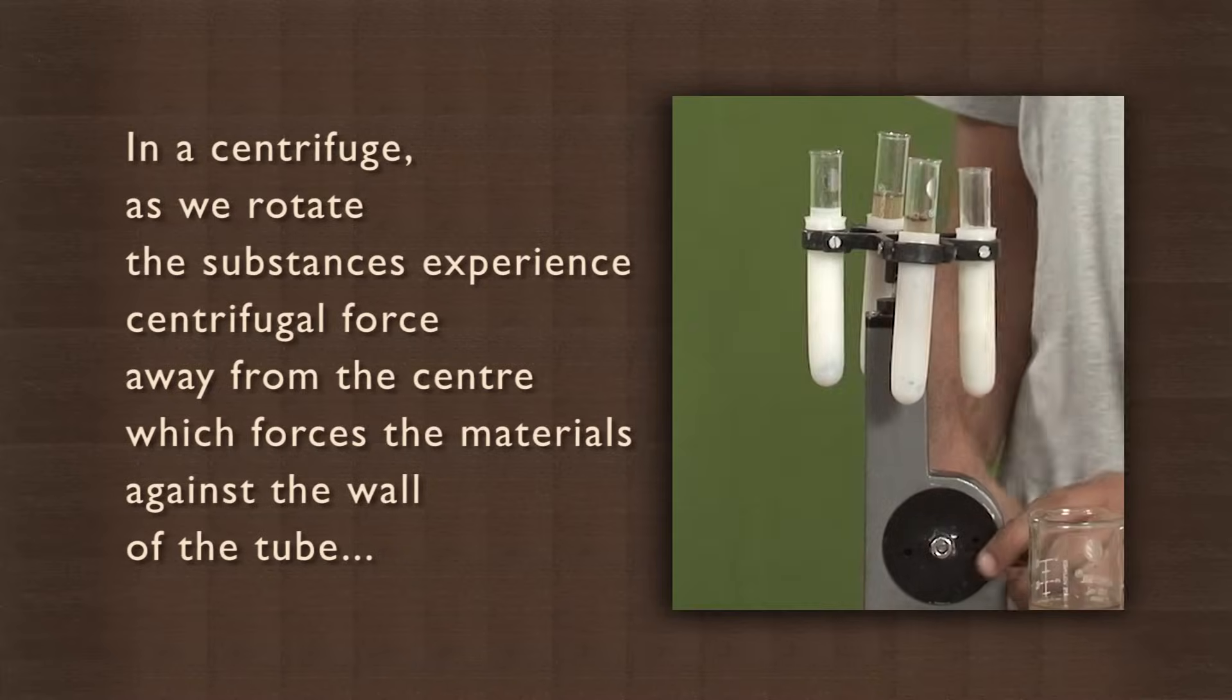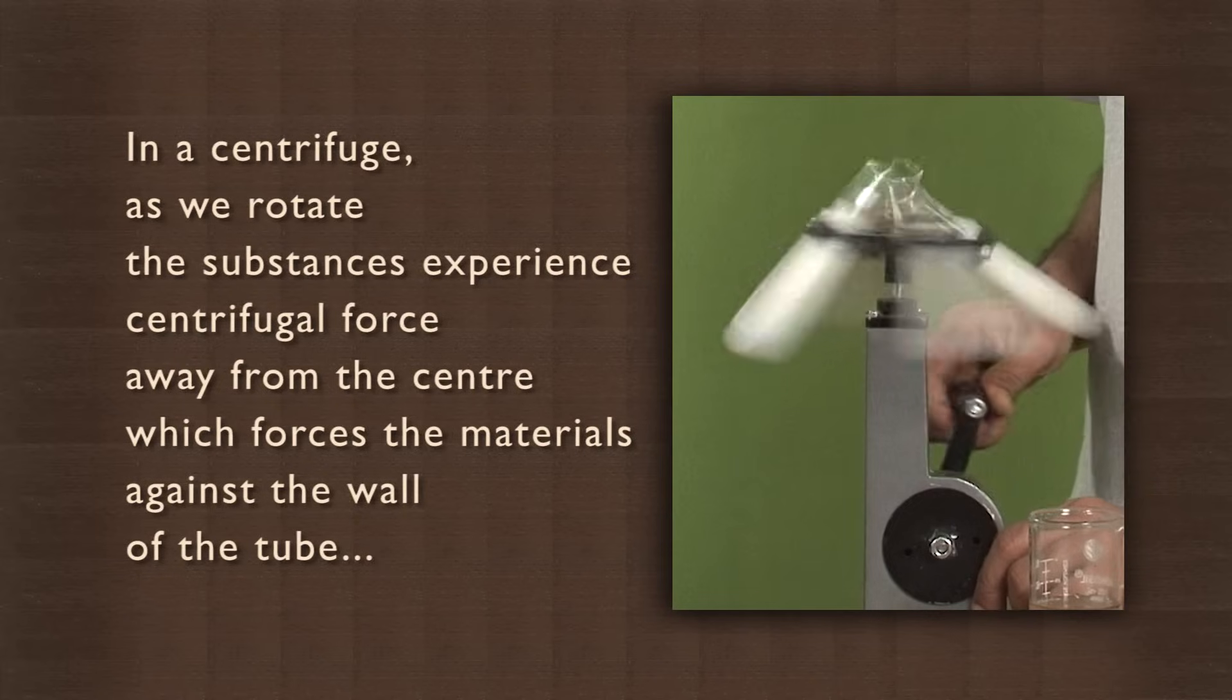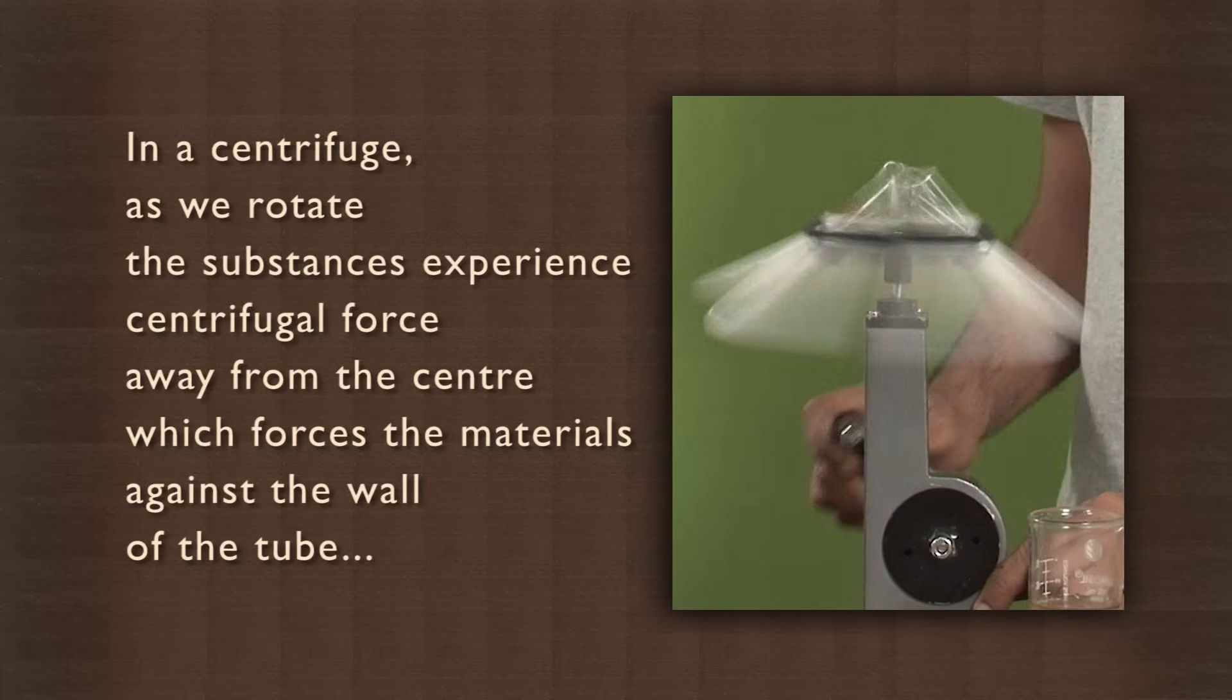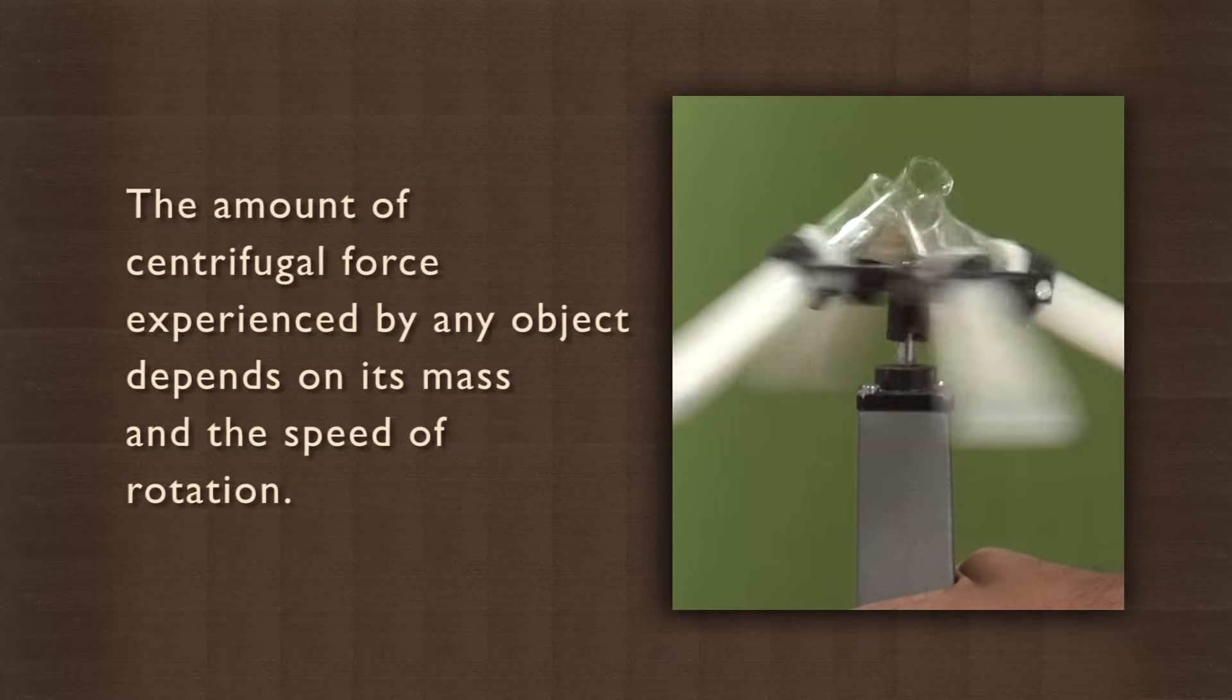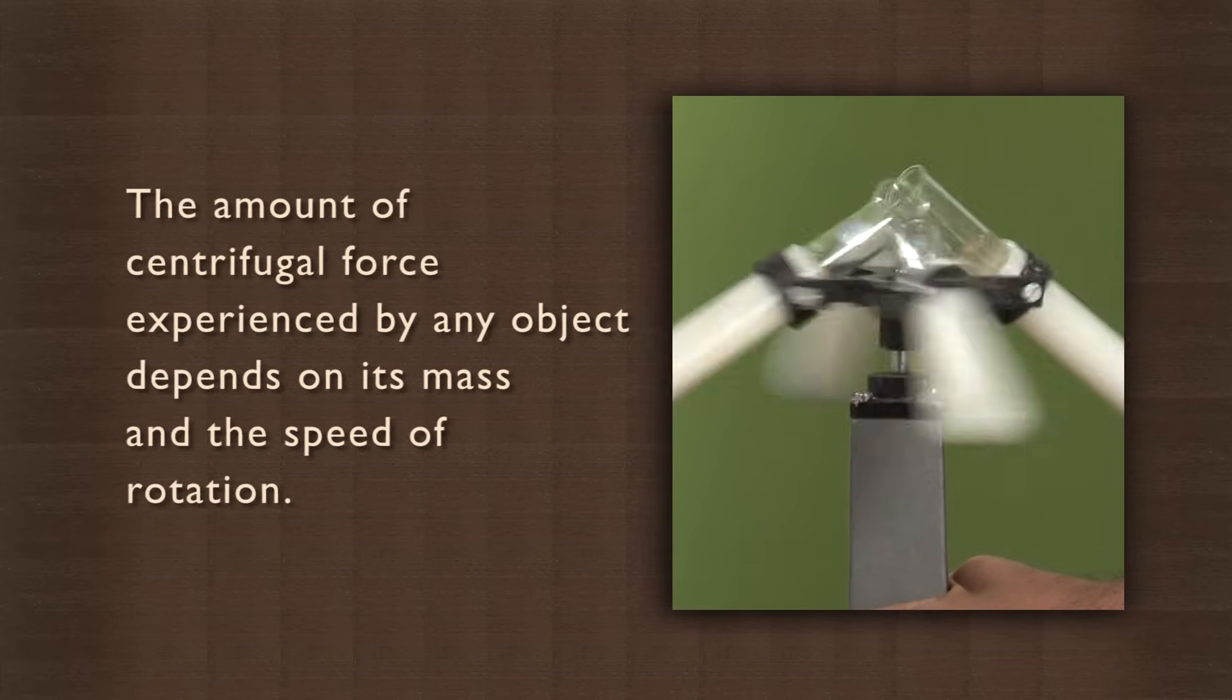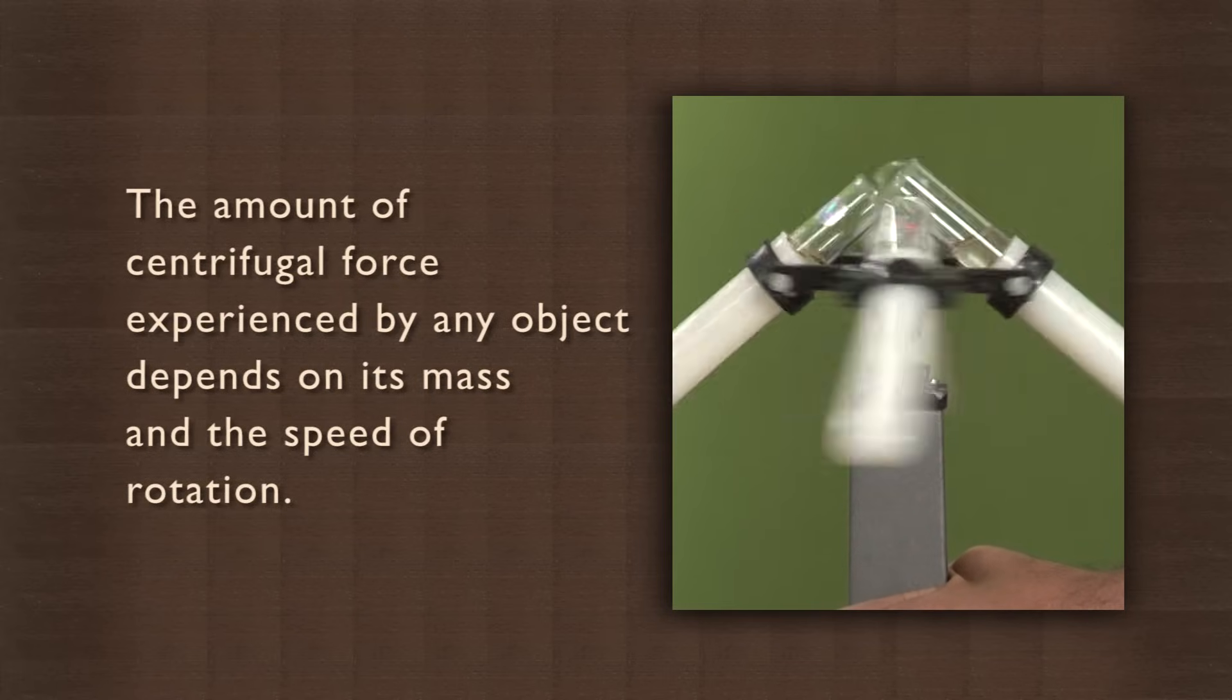In a centrifuge, as we rotate, the substances experience centrifugal force away from the center, which forces the materials against the wall of the tube. The amount of centrifugal force experienced by any object depends on its mass and the speed of rotation.